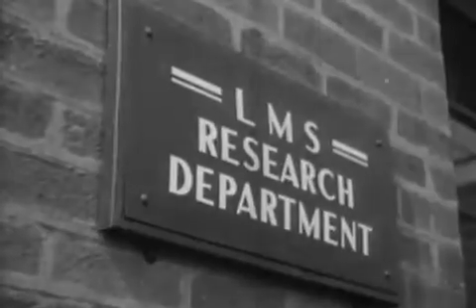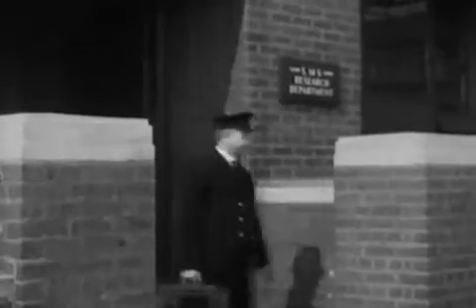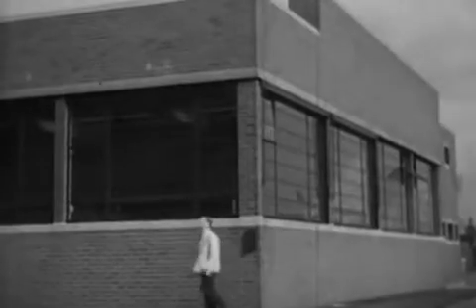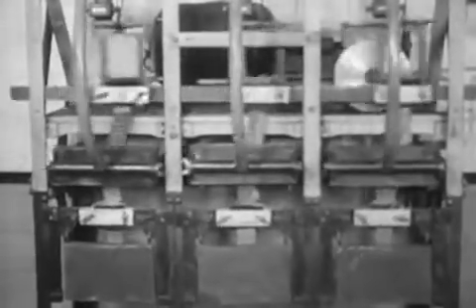In 1935, the company constructed at Derby a research laboratory where scientific work in engineering, metallurgy, paint and textiles is carried out. The research department tests materials purchased by the company to ensure that they conform to required standards. Much of the work of the textile section is of this type.